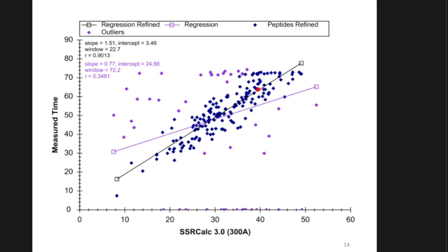So maybe in this case, I would need to go in and click on these peptides, check and make sure they were picked correctly. Maybe they're not even there and I just need to integrate over where I would expect that peptide to be. And then you'll see this pane get updated real time as I'm changing those integration boundaries.